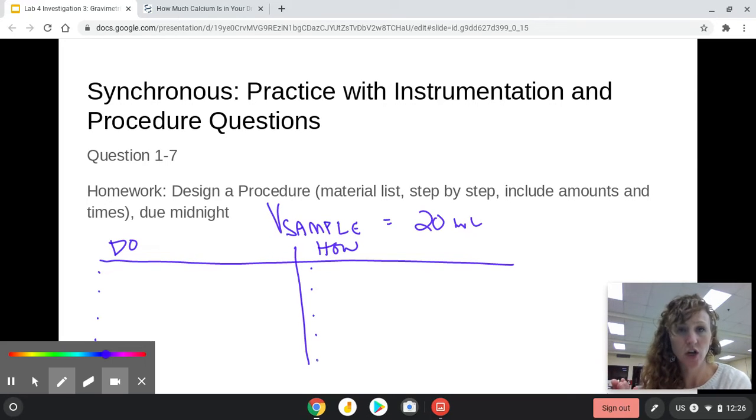And then a fourth trial where you mix in 2 grams. And you could just see if you get a difference in mass. And once your mass stops changing, once you seemingly hit your maximum amount of calcium that you can get to precipitate out, then you have added enough sodium carbonate. That's probably a pretty time-consuming effort.